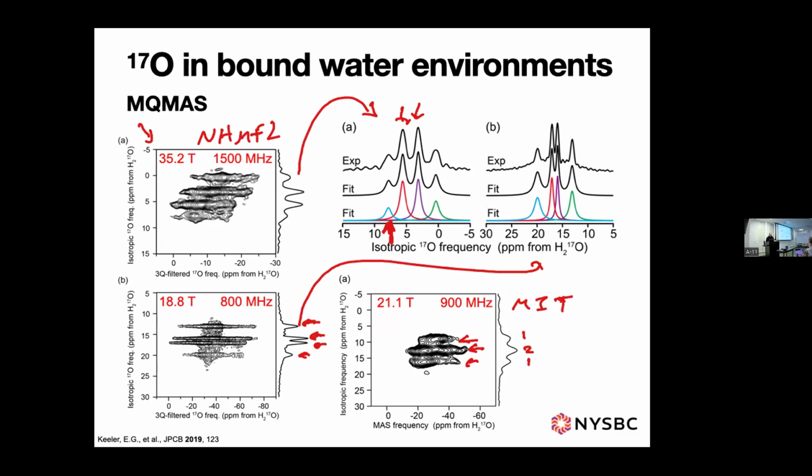Part of it is that we're limited on our 900 and how much time we can spend. They have far less limits at the National High Magnetic Field Lab because they're doing materials work most of the time on one of their 800s.